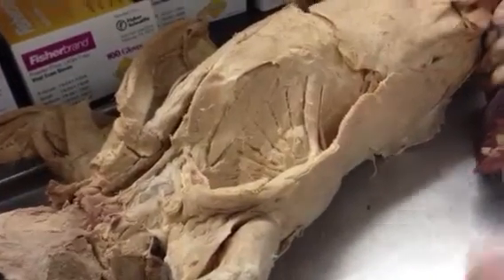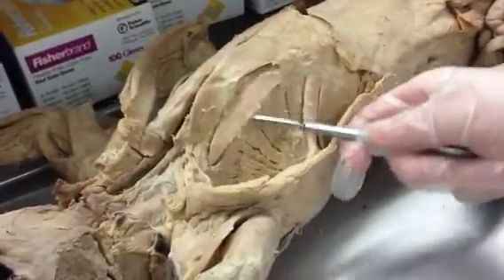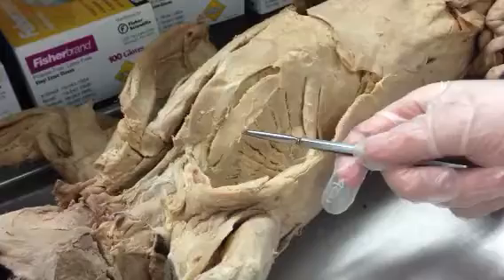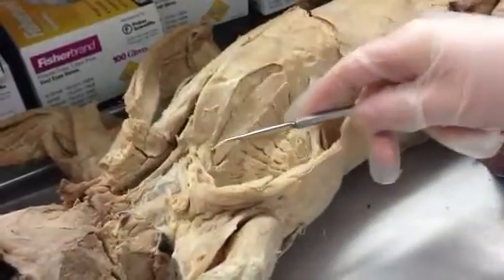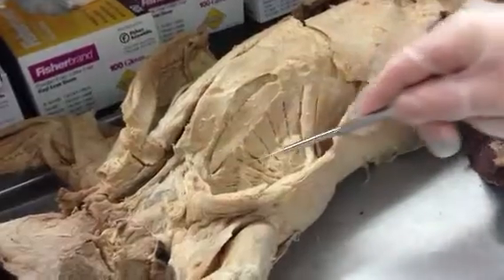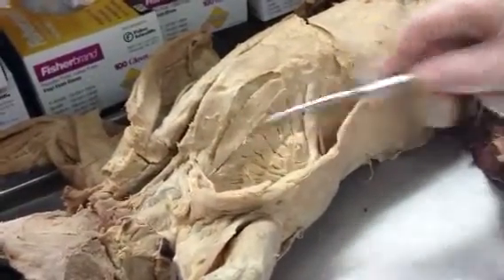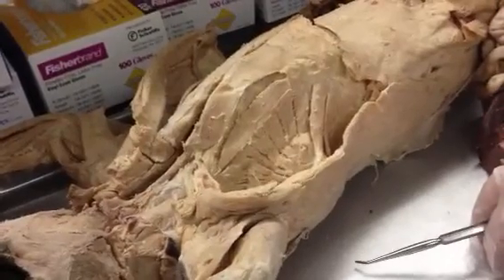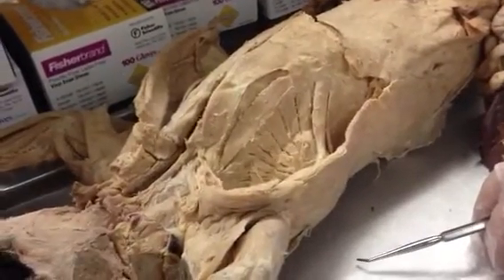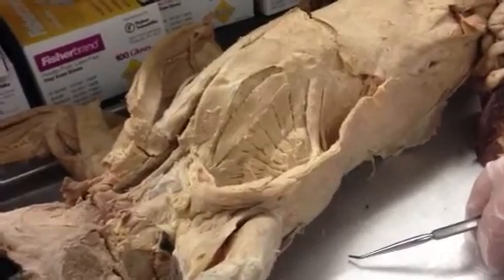They form sort of an arrow configuration when they all merge together. The big middle part is called scalenus medius. The part towards the belly, towards the front of the cat, is called scalenus anterior. And the part towards the backside of the cat is called scalenus posterior. You have to know all three — I could put a pin in any of the three scalenus muscles and ask you to identify them.